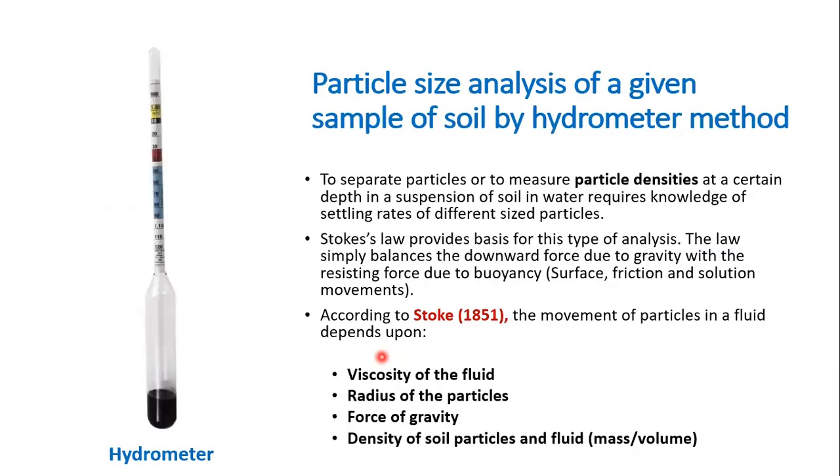To separate particles and measure particle density at a certain depth in a suspension of soil and water requires knowledge about the settling rate of different size particles. The particle size analysis is done in a fluid, so we must know how the particles move in the fluid.